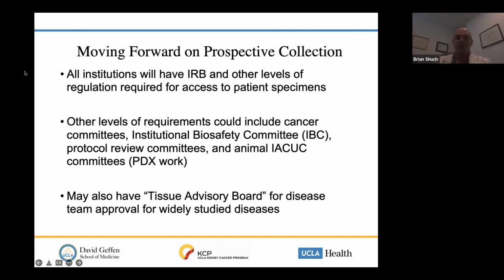We also have a biosafety committee, and for biological specimens, they want to know how you're going to handle that. Is it going to be used safely? There are also protocol review committees, and IACUC committees for PDX work. There's a lot of red tape, but once you have it in place, it's great.